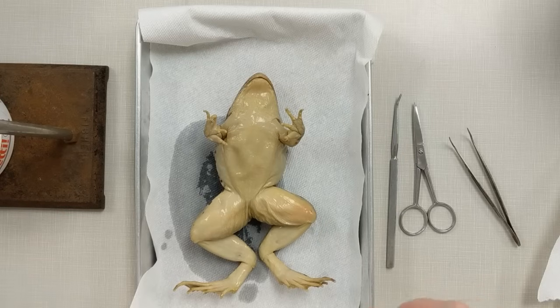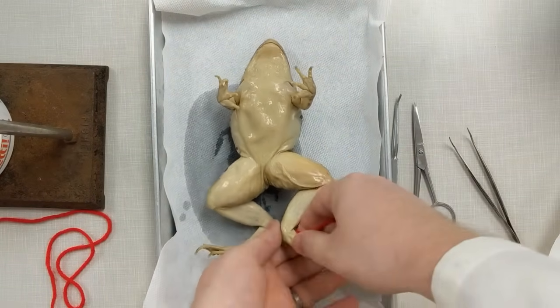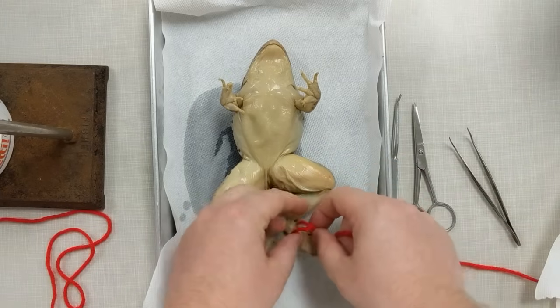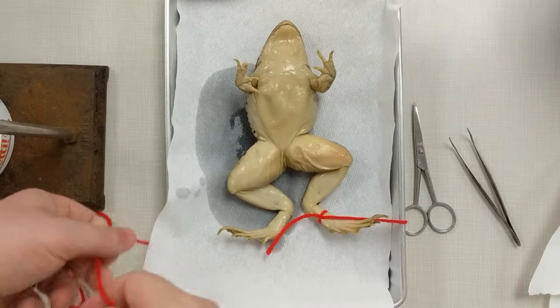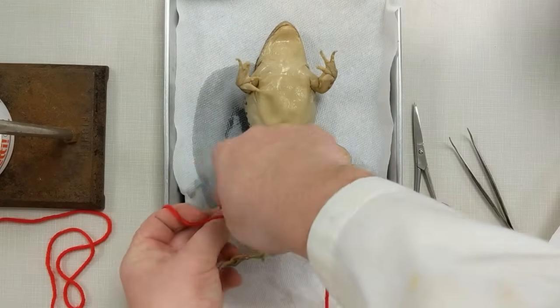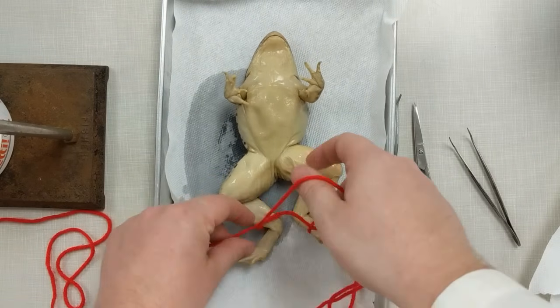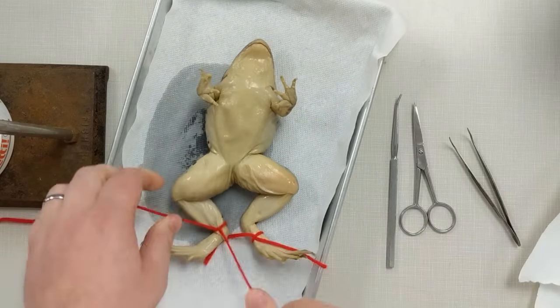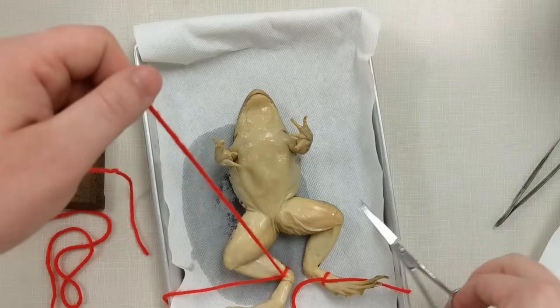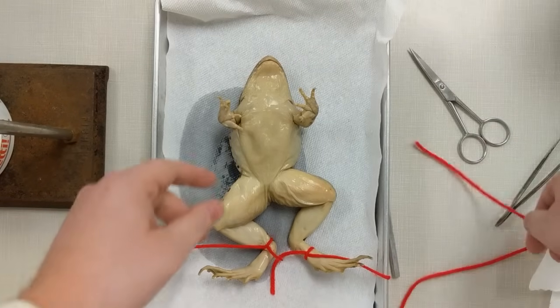The next thing we'll need to do is tie down our frog. We're not going to use pins because you can't really pin through bone, so we're going to tie it back. You'll wrap a piece of yarn or string around one part of his leg, take it below the tray, and wrap it around on the other side. Make sure to tie it tight, otherwise it could move around on you as you're cutting. Make sure it's tight and centered, then cut off any extra string.